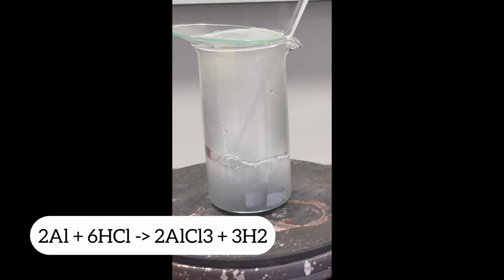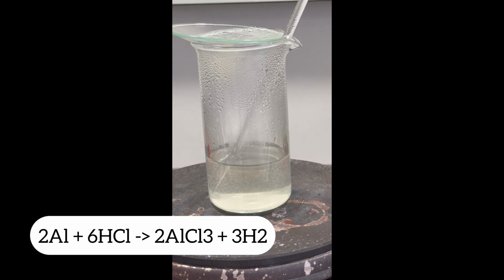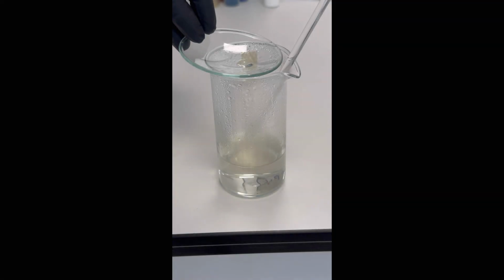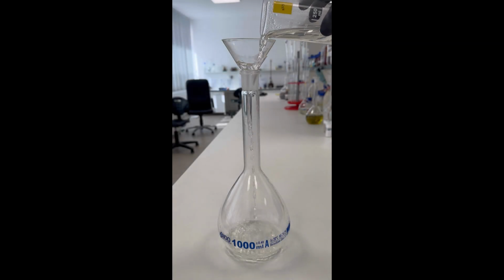Near the end of the dissolution, the cloudiness should start to disappear. When no more aluminium is present, the beaker is removed from the heat. The watch glass is washed with distilled water, and the solution is allowed to cool down to room temperature. It is then transferred to a 1-liter volumetric flask.